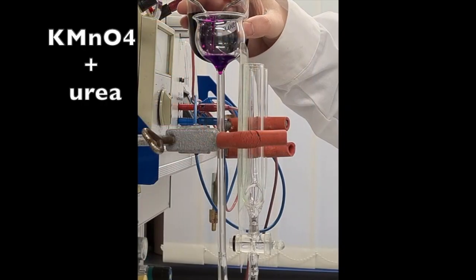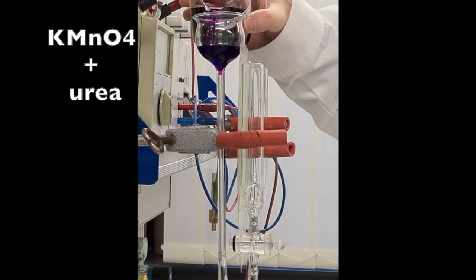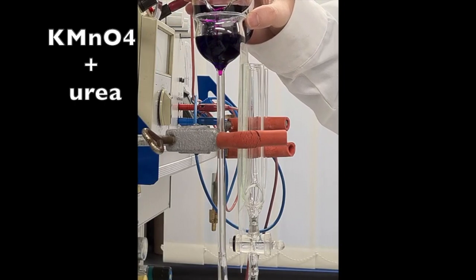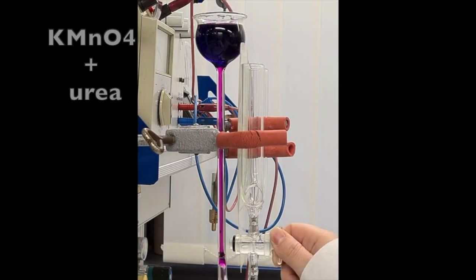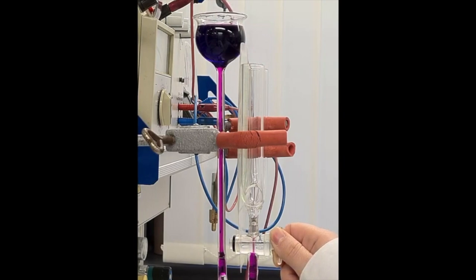Potassium permanganate solution, in which 80g of urea per liter are dissolved, is poured into this funnel with the stopcock closed. The stopcock is opened until the bore of the stopcock is filled with the purple solution. Avoid air bubbles.